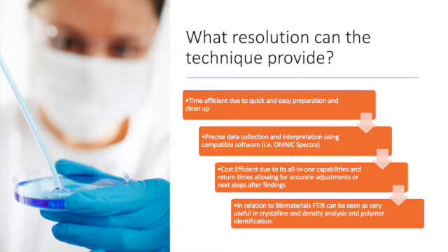FTIR spectroscopy could be seen as an all-in-one technique for quantitative measurement. It is quick and easy to use and overall very precise when identifying materials, which leads to it being cost-efficient due to not only its multi-purpose use, but also the data given helps scientists and specialists determine their next steps after their findings.